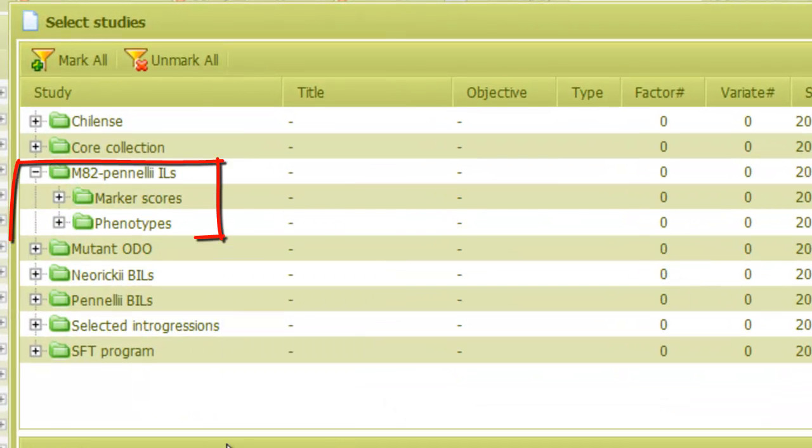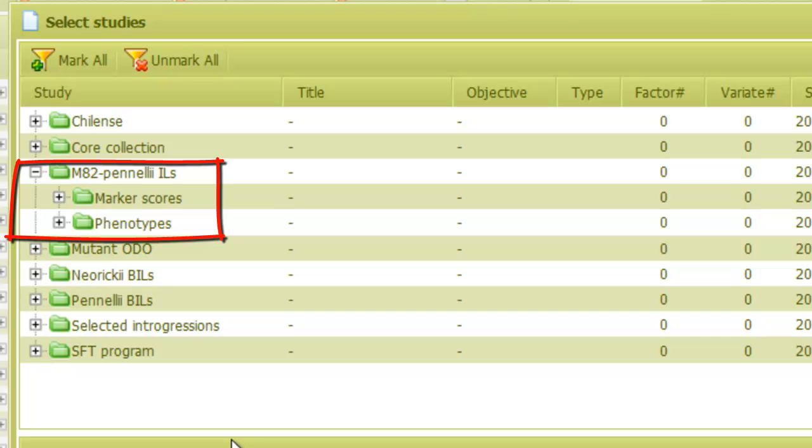When I open the folder, there are two subfolders, which are marker scores and phenotypes. As can be expected, the marker scores folder holds genotype studies where markers were scored on this population, while the phenotypes folder stores traits data.